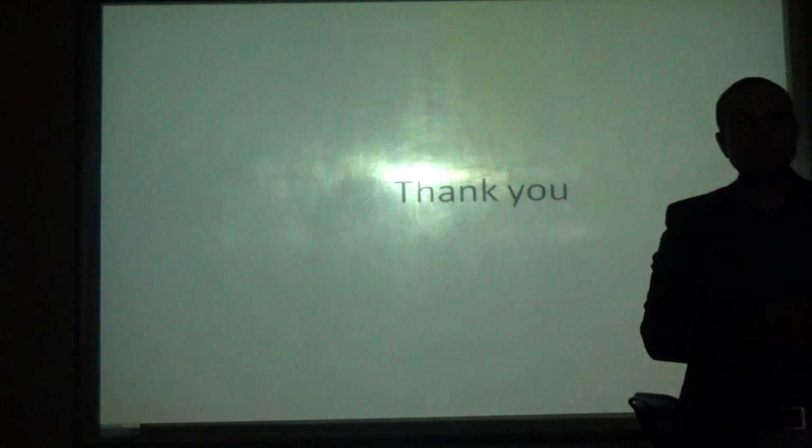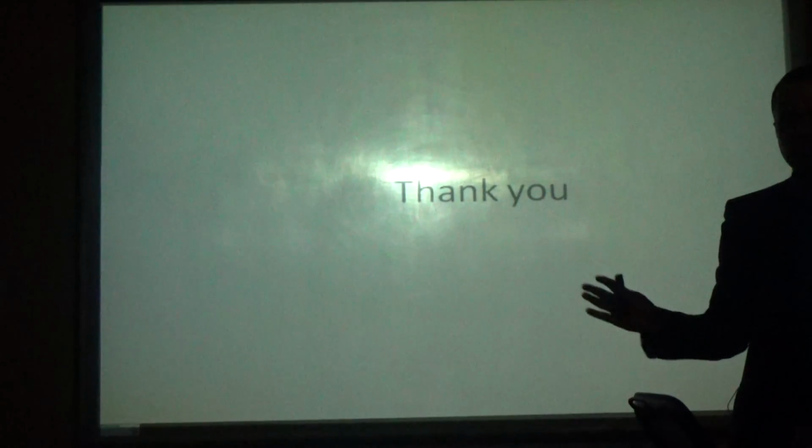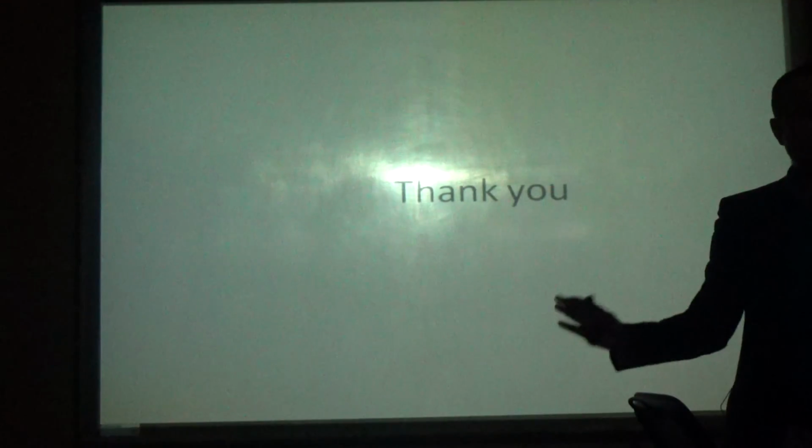Any doubts you have in this? See, these are all the slides I have kept, all classical slides I have put up for you. Almost 75% of the slides are from the Robbins book only. So if you study, you will be able to pick it up. Any doubts you have in this?